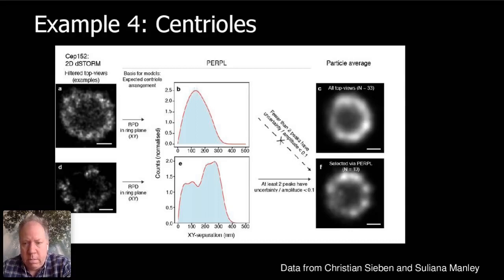Gillian Dixon wants to know how long the processing portion takes. Is it hours or days? Is it longer or shorter than it takes to take the data in the first place? It's actually pretty quick. I'm the test subject. I've run it on my Mac, just a standard Mac, and I've run the analysis on the nuclear pore data, and I'm a bit faster than a PC. I think it took me about 5 minutes.